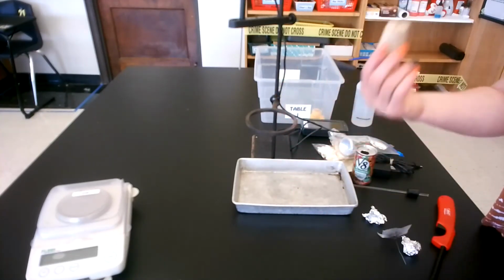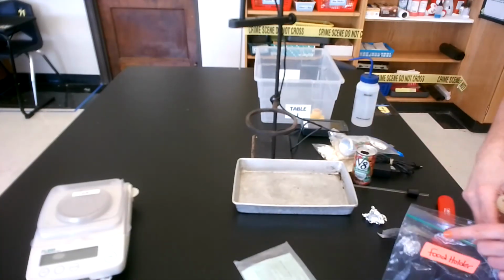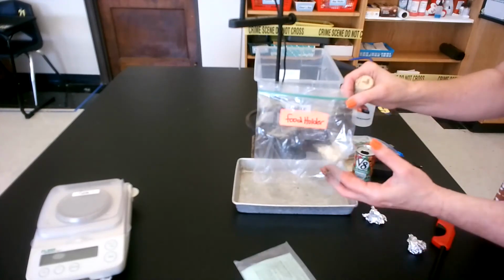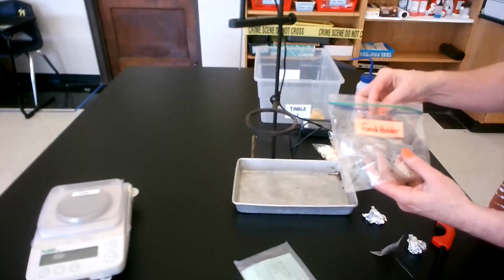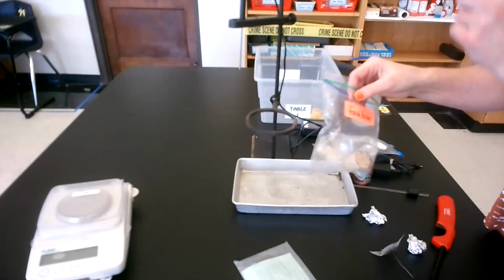Cork will go back in your tub, and if you are one of the classes that has to restock, then I'll give you a new bag with foil and the little screen and paper clip, and you're simply going to put the cork back in and put it back in your tub for the next class. If you're the last class, just put the cork back into the bag and put it in your tub.